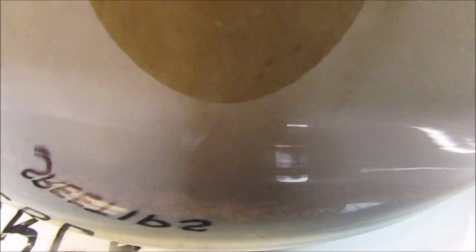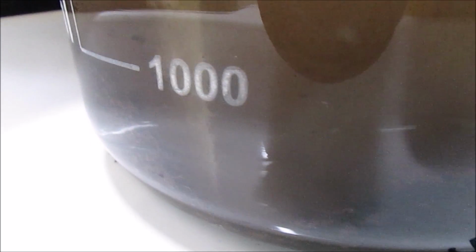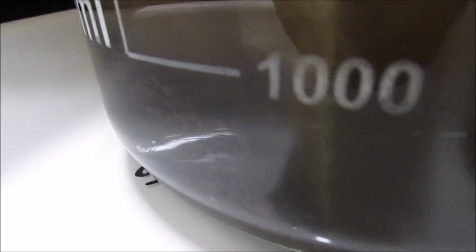Are you seeing what I'm seeing down there? It's a whole pile of black powder down here. There's some red on there, which is, I don't know what that is, probably rhodium. Rhodium's color is red. It's looking like there's going to be a lot of platinum group metals here.